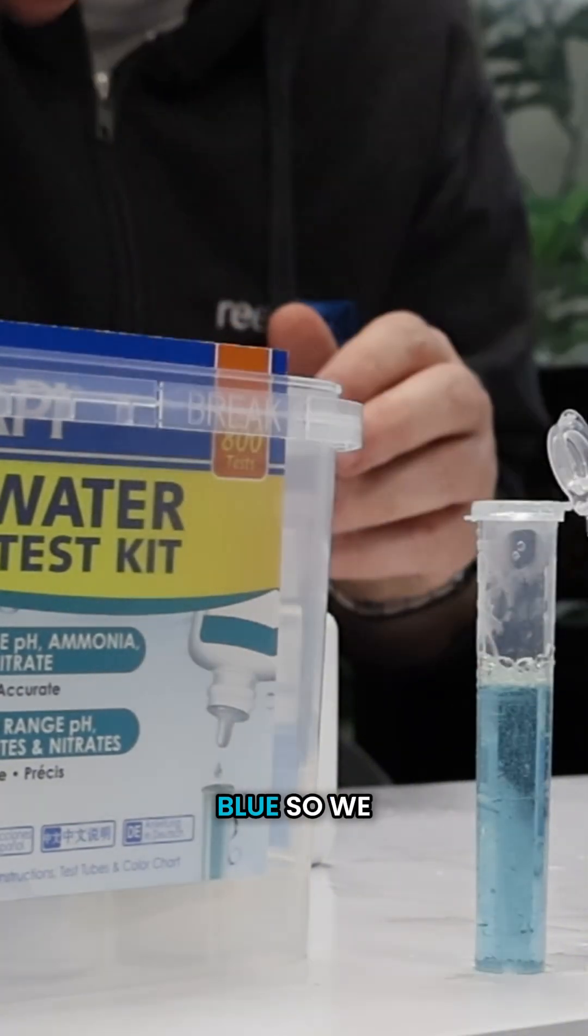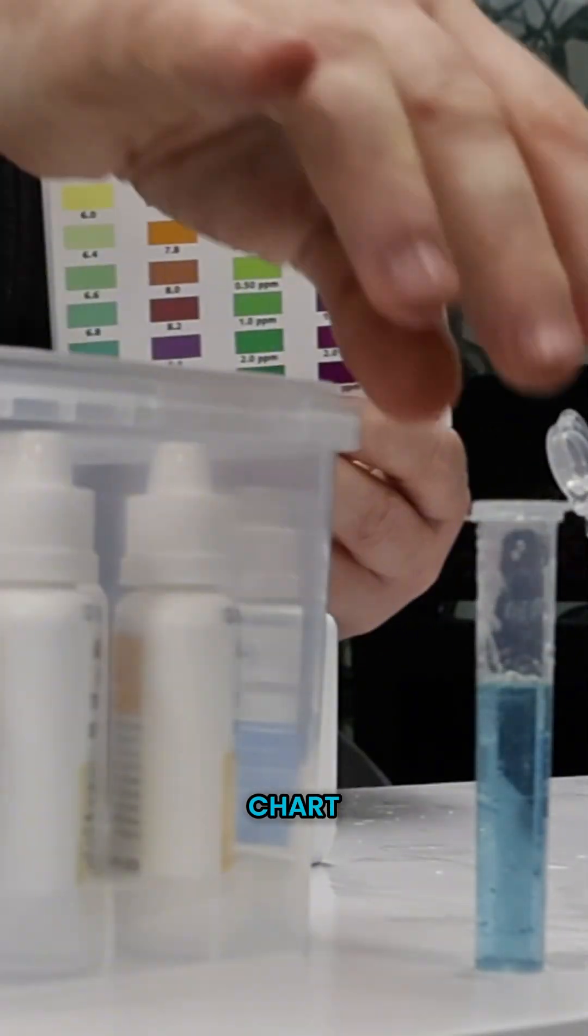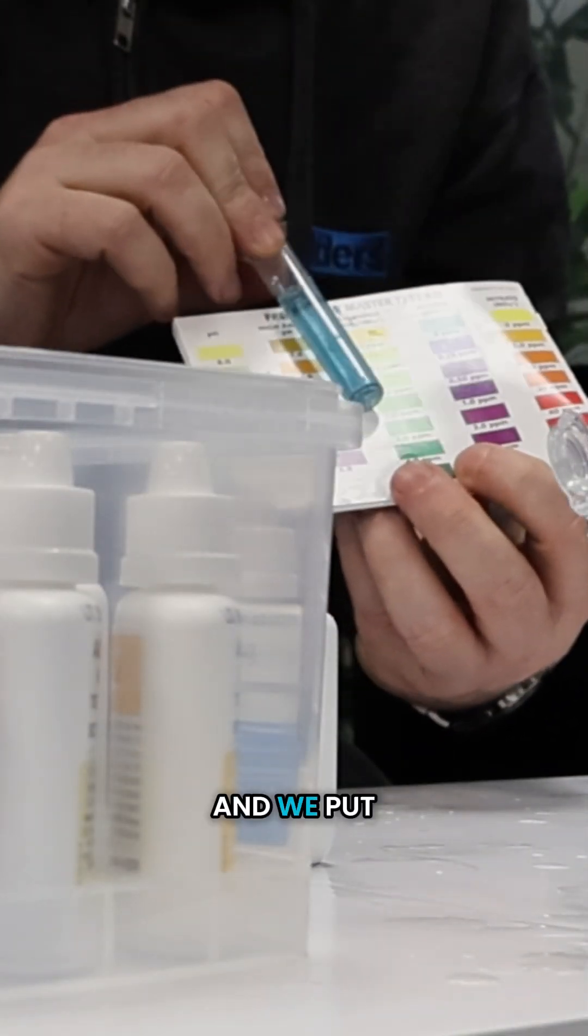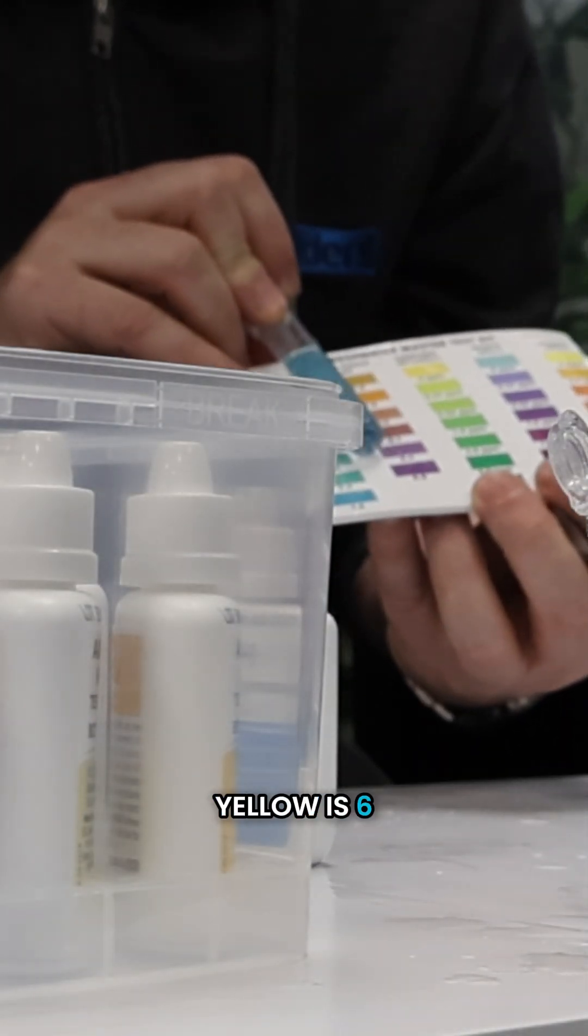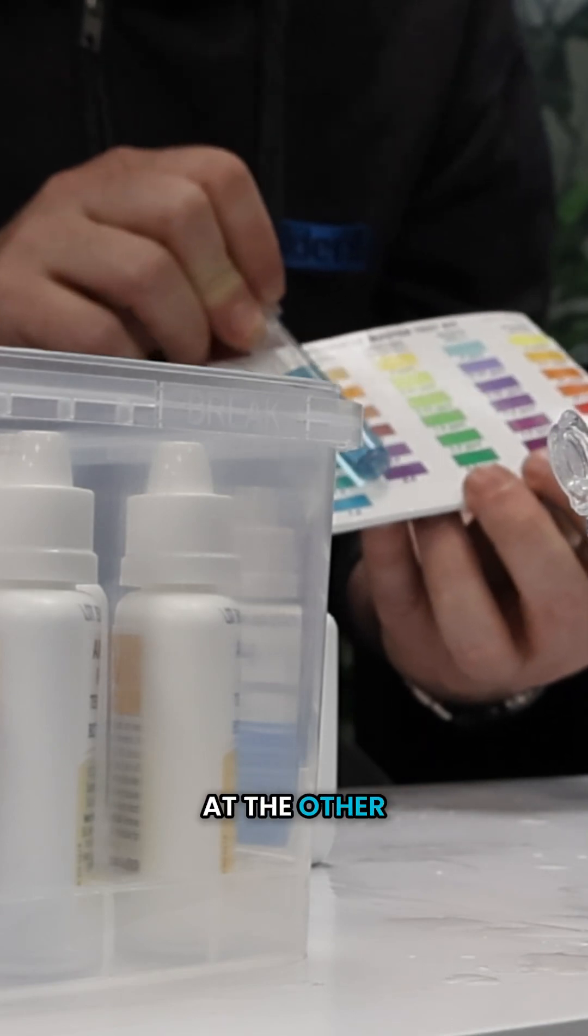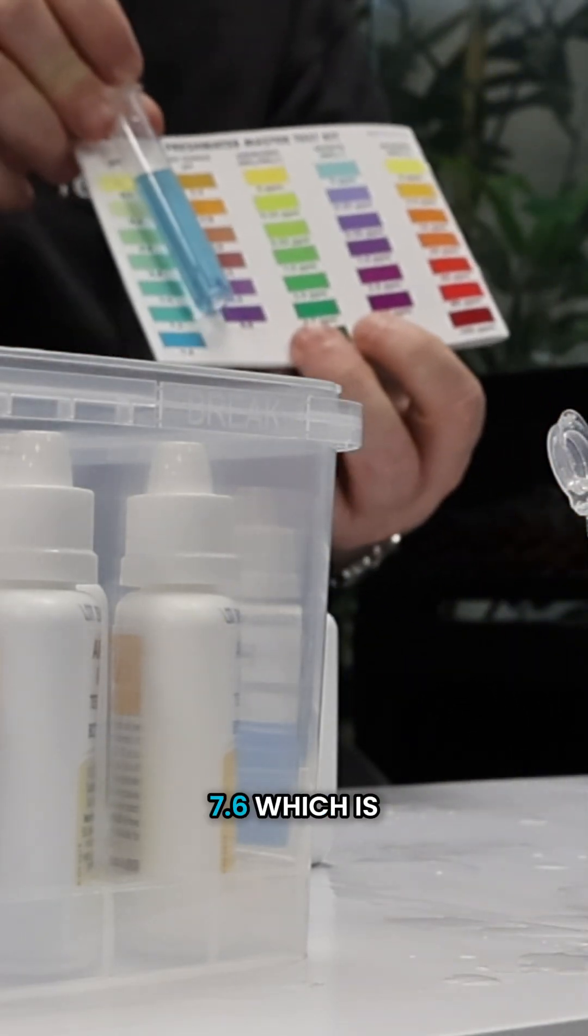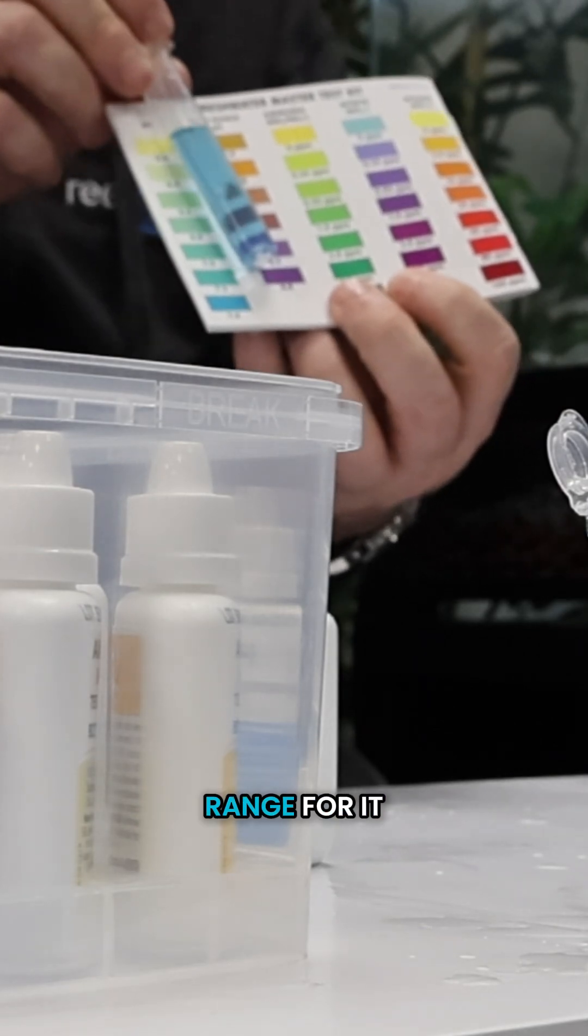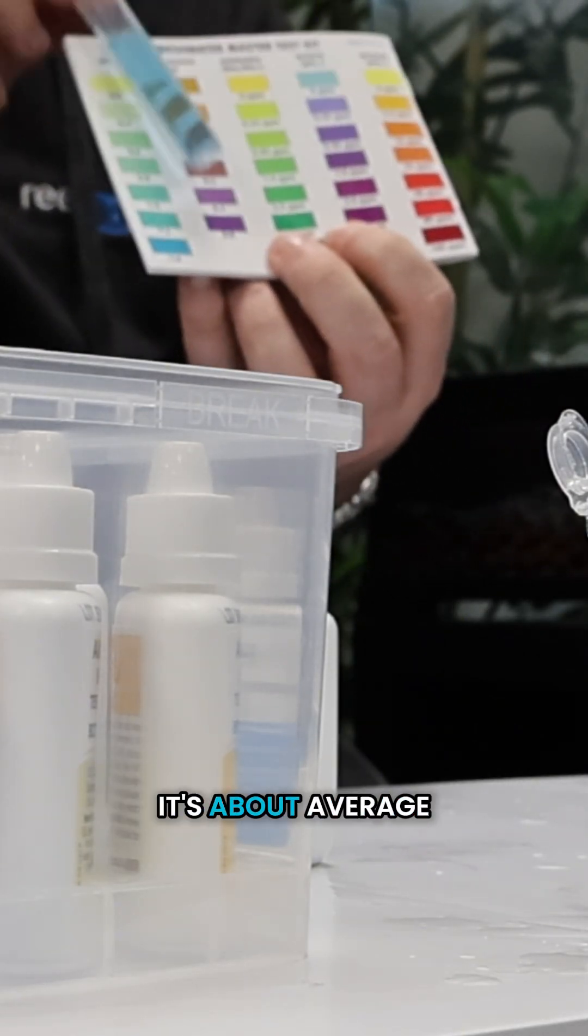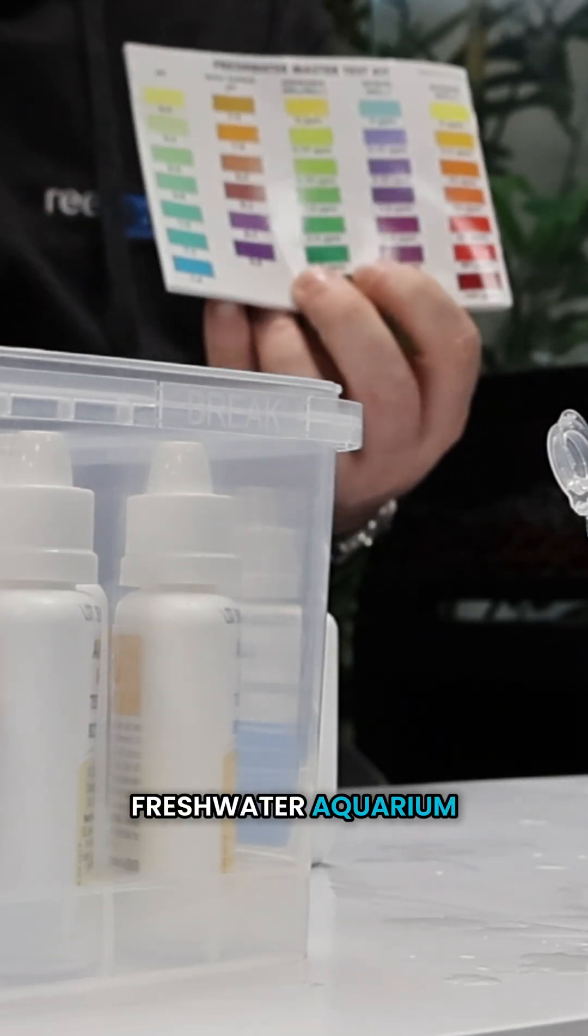And that's turned blue. So we get our color chart and we put it up against our pH reading. Yellow is six, blue is 7.6 at the other end. So we've got a pH of 7.6, which is a good pH to aim for. It means it's got some buffering capacity. It's about average for a UK freshwater aquarium and those platys are going to love it.